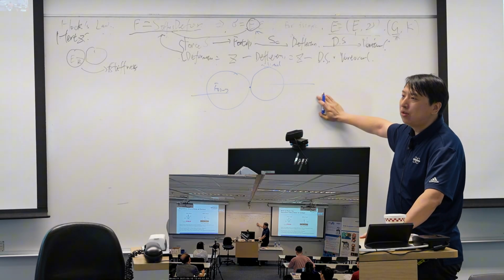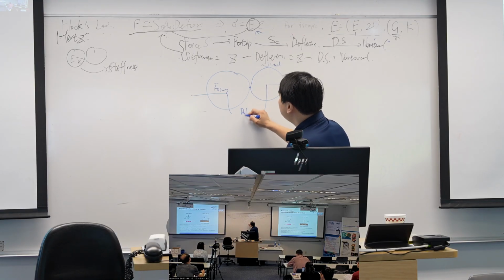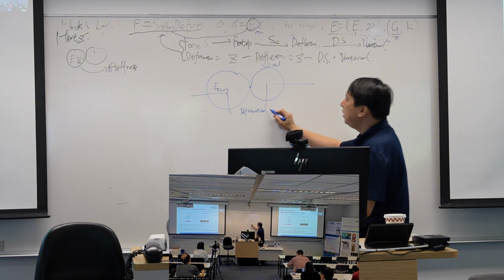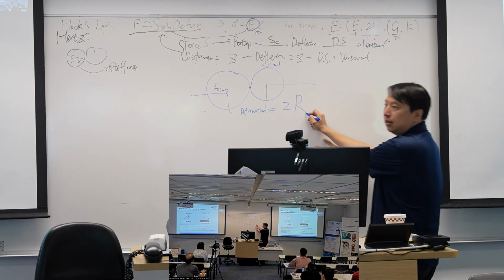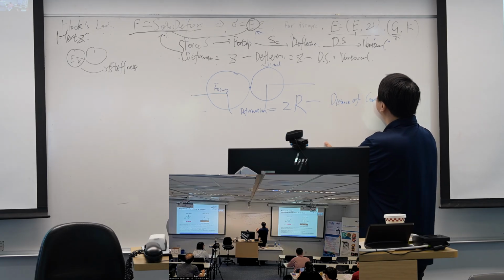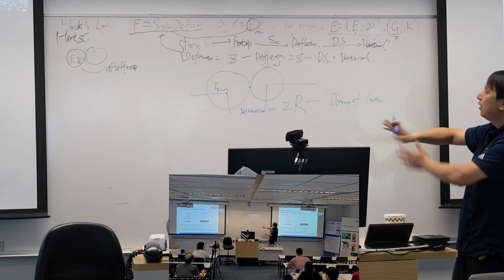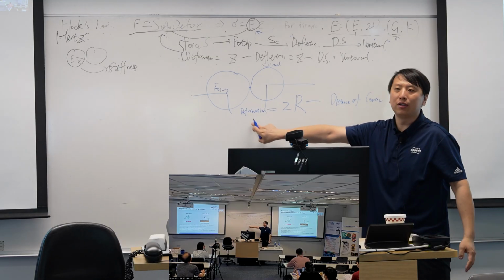And Hertz would define the deformation to be equal to 2r minus the distance of the centers, right? As you squeeze, the distance of the centers will reduce and it will cause a deformation.